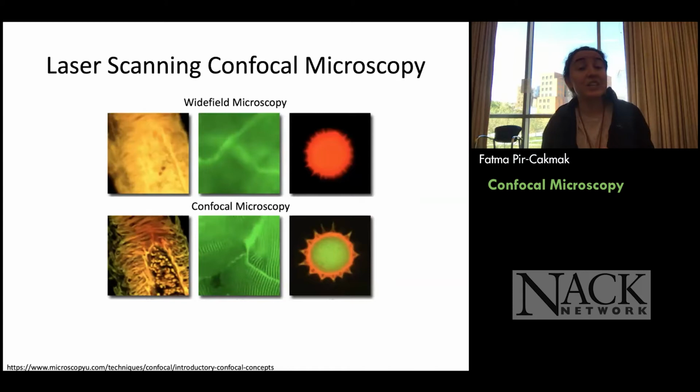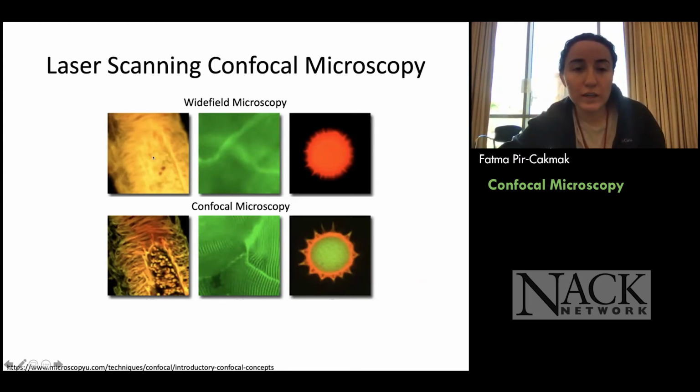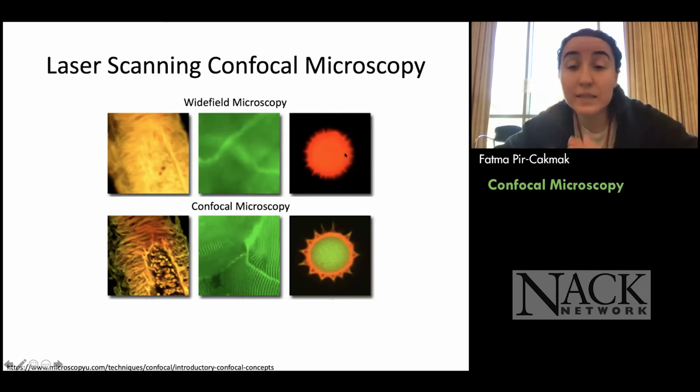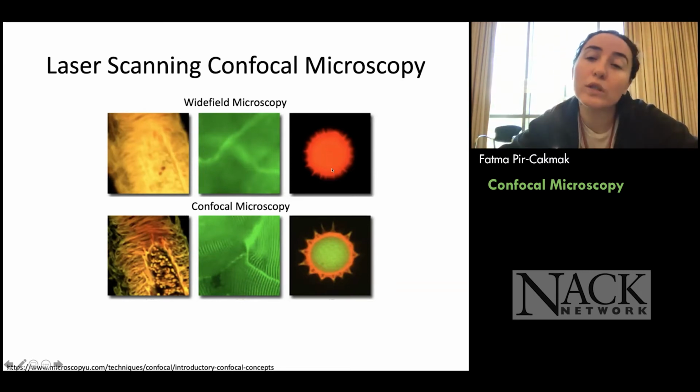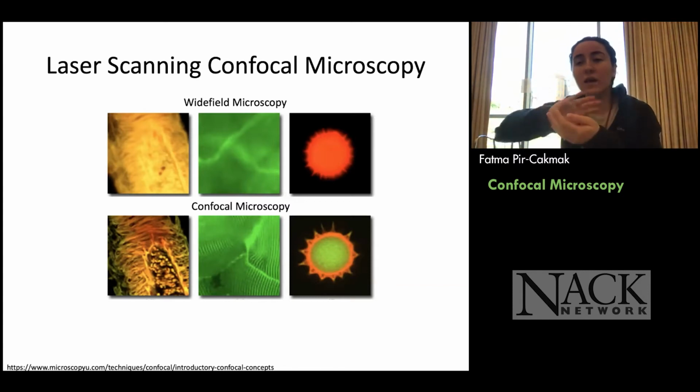And this actually helps you a lot, right? Because you are able to look at a certain slice, and it gives you better resolution, and here is how this reflects in the images. If you look at wide field epifluorescence microscopy, you will see all the signals coming together at the same time. For instance, focus on this red one. It's maybe a virus particle or something like that. You are just seeing the outside of this structure.